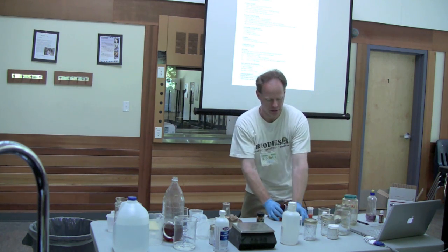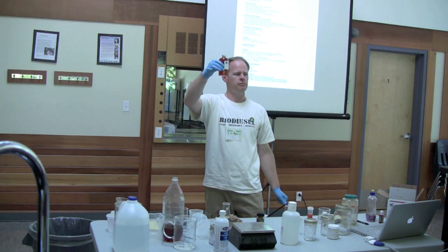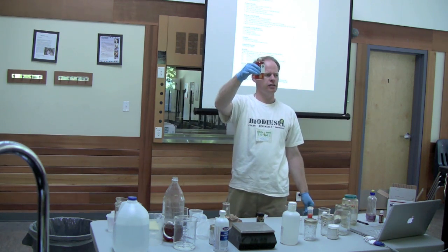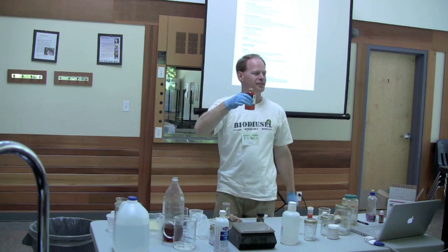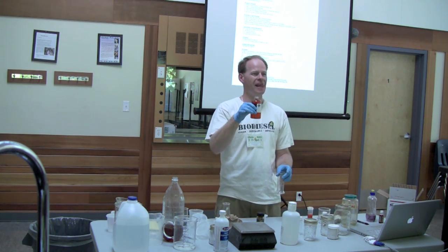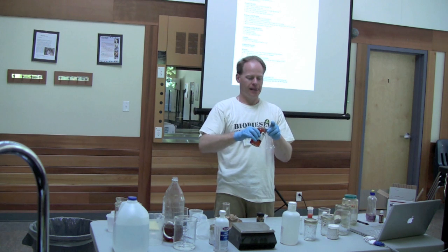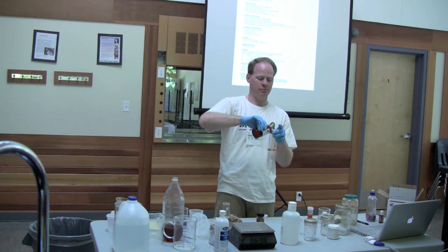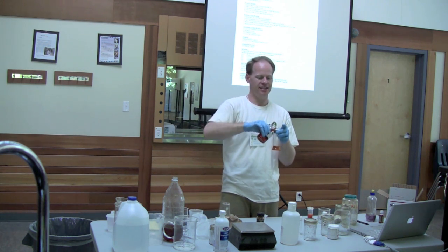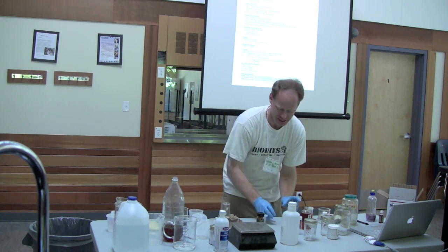Give you a little bit of background on this test. This is B100 fuel that came from a commercial facility? That's right. You get to see how good this is right here. Who made this? Are they in the room? No, they are not. Oh, cool. We get to see how good this fuel is. Sacrificial lamb, for them. Let's hope it passes, huh? Smells good. Passes the sniff test.